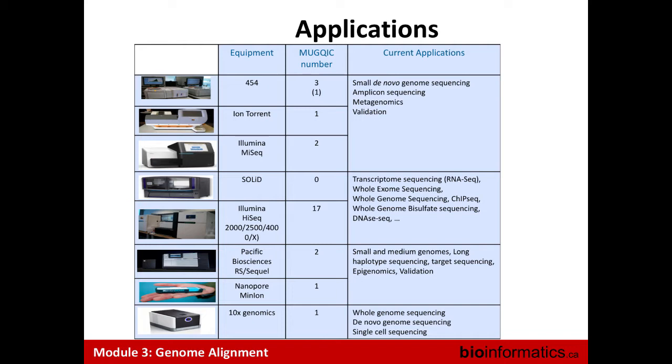The long reads are really used for genome assemblies most of the time. They are also used to do haplotype sequencing, targeted sequencing, some epigenomics, and sometimes some metagenomics where we want to cover the full 16S region. So all this data could be used.